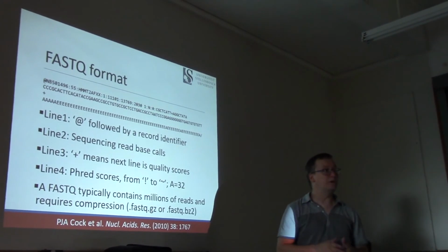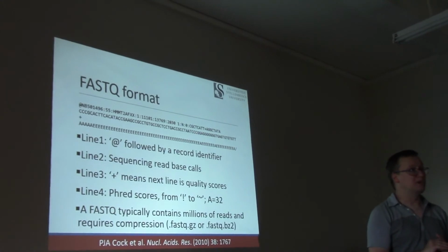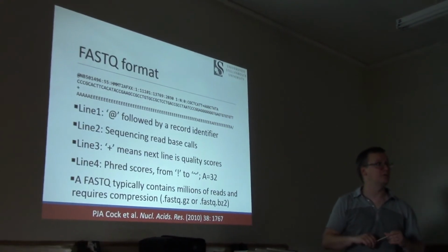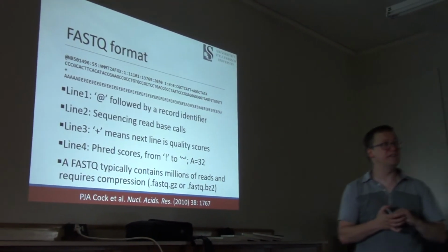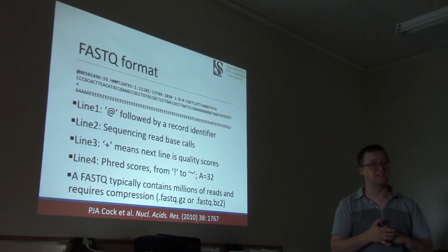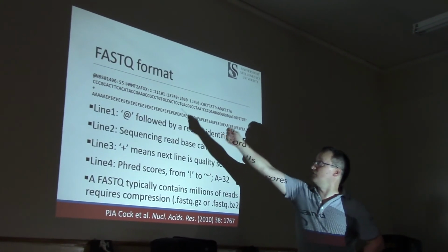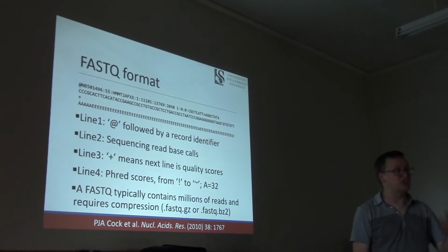All right, when we run a sequencing experiment over at the facility, you're going to get an output to work with. And typically, that is an output in FASTQ format. FASTQ is a very widely used format, and I want to note another weird computer sciencey thing that's going on here. If you look at the top line in this little segment of 4 lines, the FASTQ file basically digests into 4-line chunks.